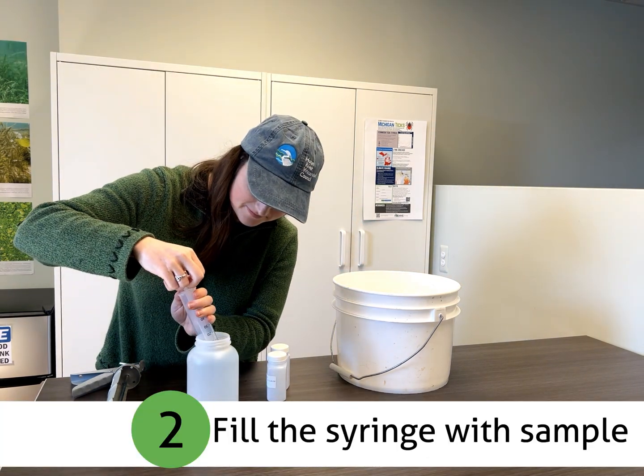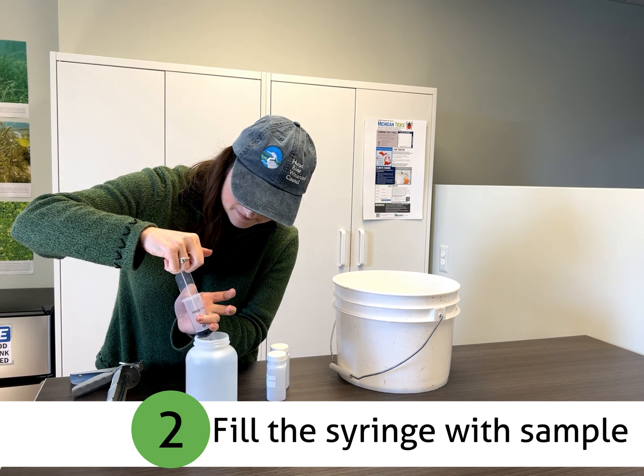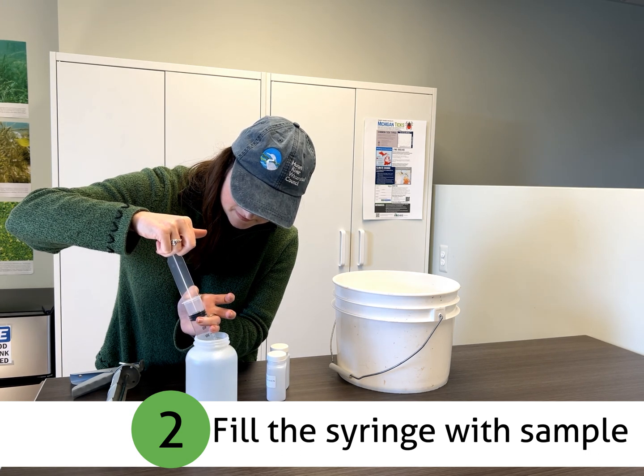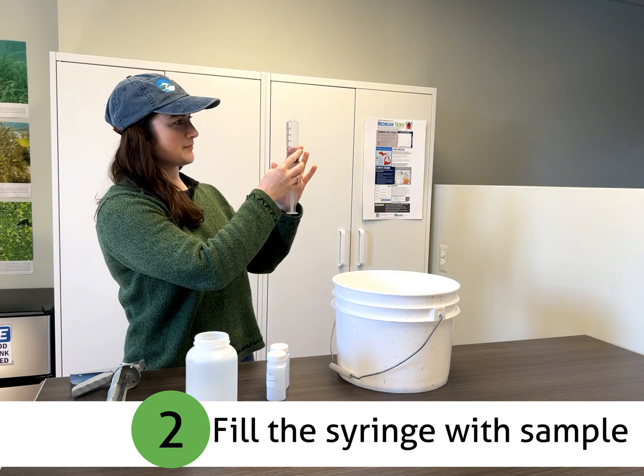Rinse the syringe three times, and then fill the syringe full with sample to the 50 or 60 ml mark on the syringe. Take care not to get air into the syringe.